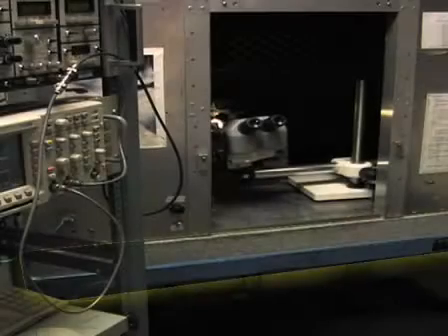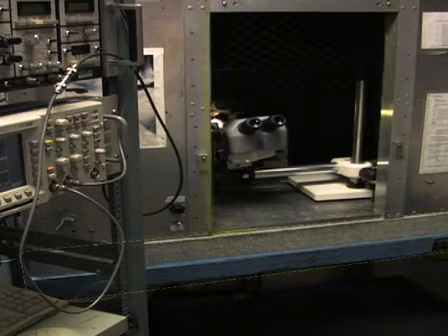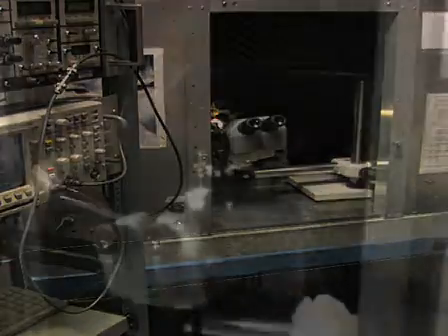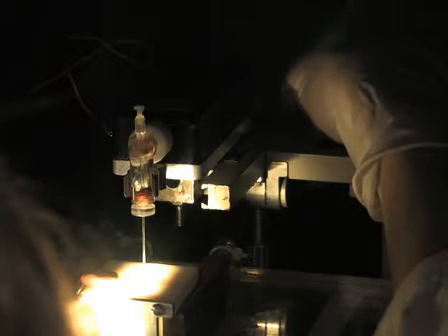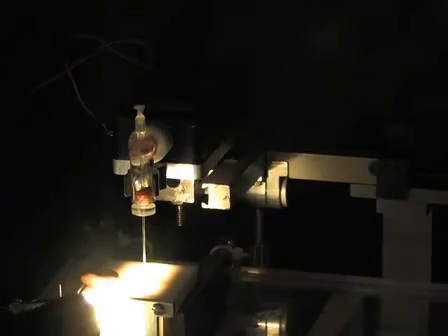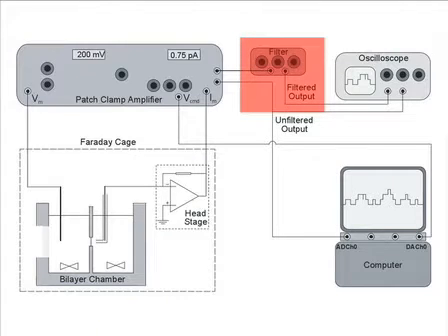Our electrophysiological setup consists of the following: an air-suspended anti-vibration table to minimize mechanical vibrations, a Faraday cage to shield against electrical noise, sound, and vibration, and a stand for the bilayer chamber. We use a circulating water jacket for temperature control in which the bilayer chamber is placed, and a micromanipulator to mount the head stage of the patch clamp amplifier. An electronic filter unit is used to further filter the output from the patch clamp amplifier at 500 Hz to visualize the current transitions.